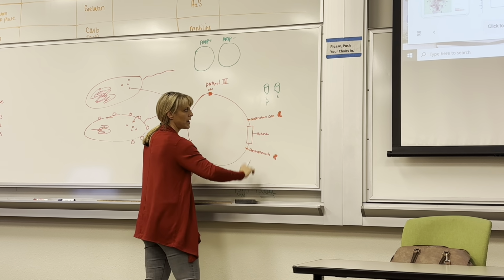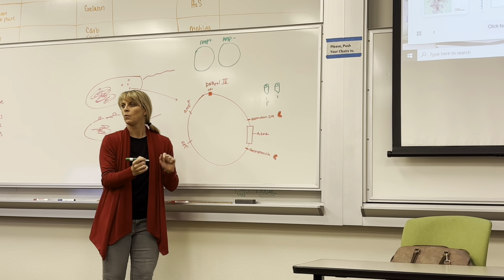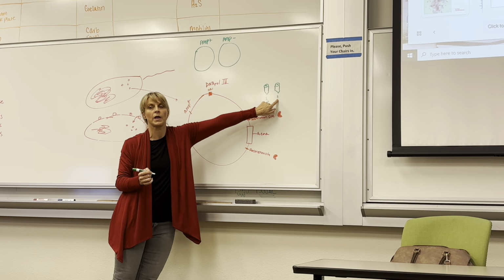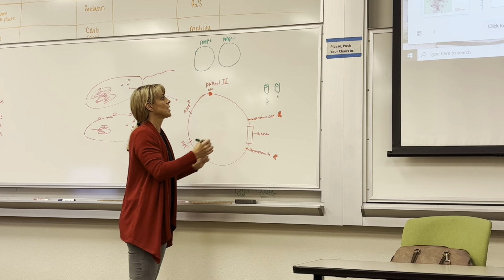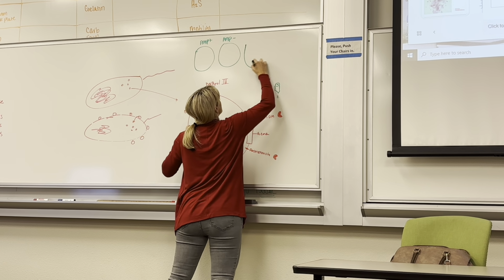So 2 results. Here was the positive, here was the negative. One had E. coli with the plasmid in it, and one had just E. coli. Those were our testing trials. So then here, we had 4 plates.